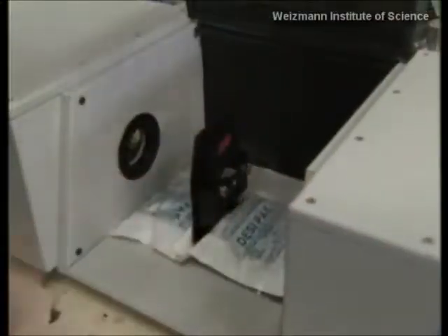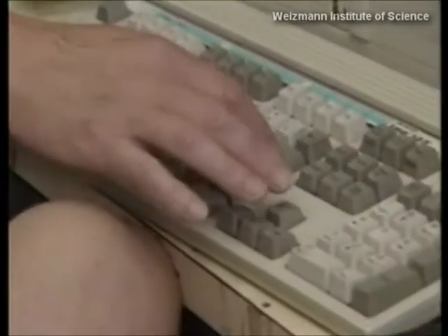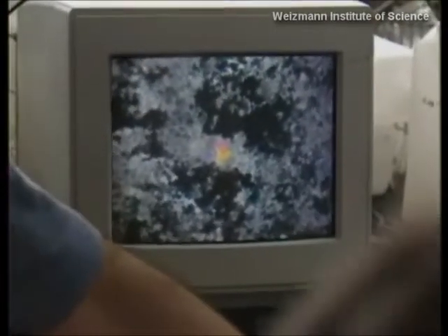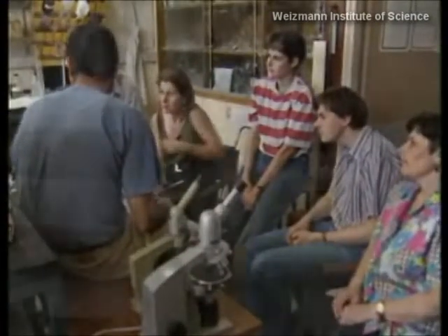Doing things in real time makes a major change not only in the interpretation of the finds, but also in the excavation techniques and strategies as they change from day to day. The portable lab is already attracting international attention. In a workshop held recently, archaeologists from 7 countries spent several days on the Weizmann campus and in the field, learning how to apply the technique to a wide range of projects.